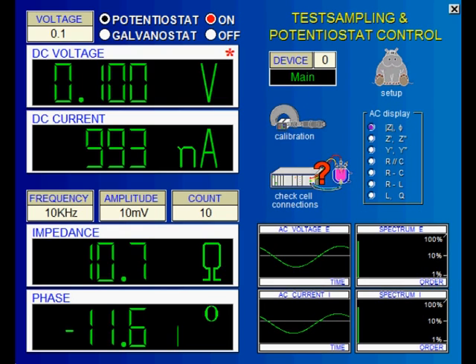An ideal quality shows smooth sine waves in the time domain displays and no harmonics in the frequency domain displays. With the DC voltage and the AC amplitude set, we have checked the quality of the signals at a certain frequency.